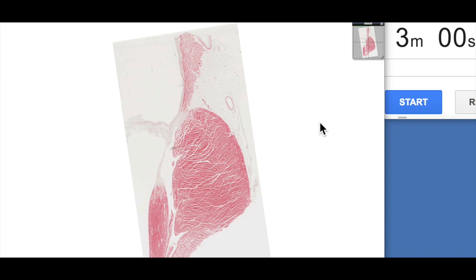G'day everyone, Jamie Chapman for another episode of 3 Minute Histology. In this episode we're continuing our look at this section here, a histology of the heart, so we'll be continuing our look at some of the major features which we can see here. Let's start our 3 minutes.